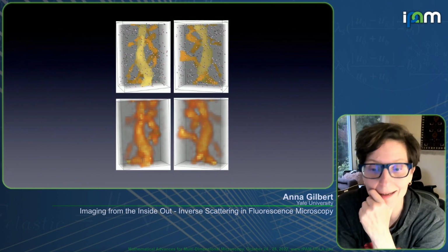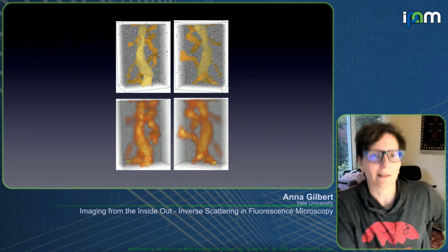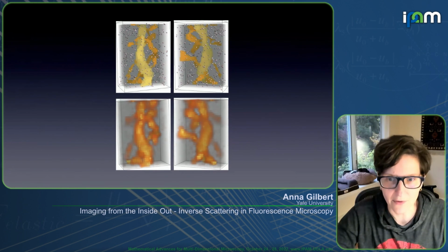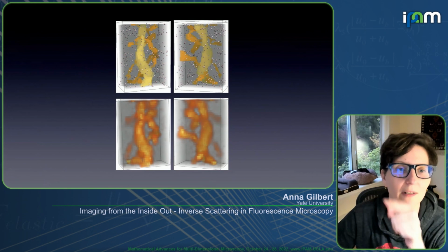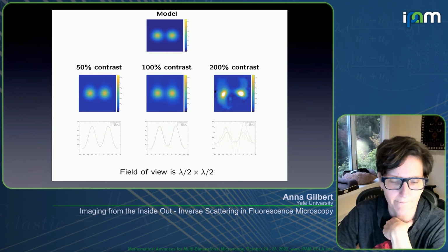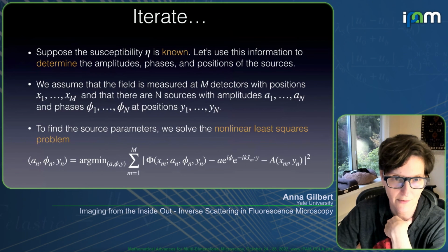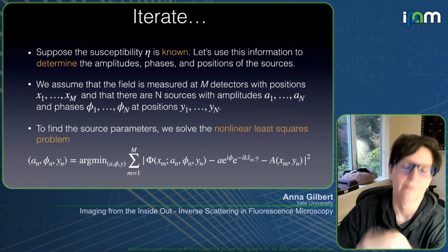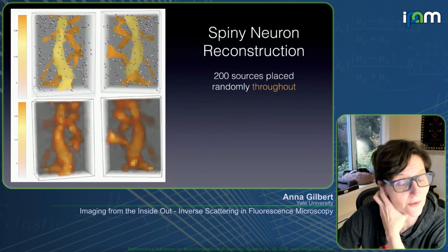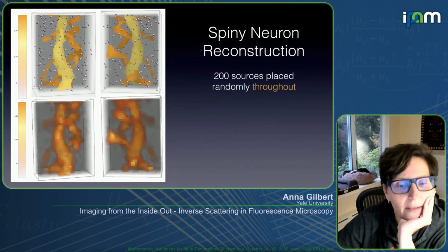They're not bad. So I'm going to do like a lens A versus lens B trick on you. Here is the reconstruction where we don't know where the fluorophores are. Okay, hang on. Sorry, there's a delay. Here's a reconstruction where we do know where the fluorophores are, but they're placed randomly.